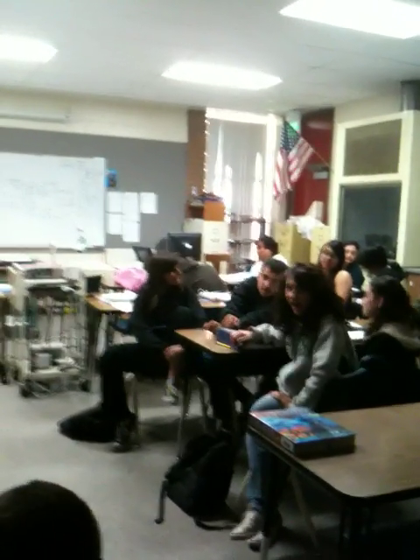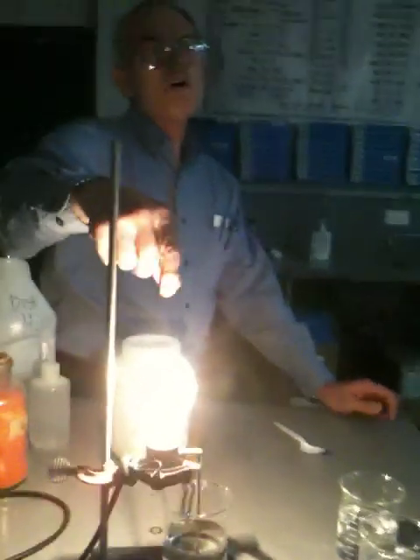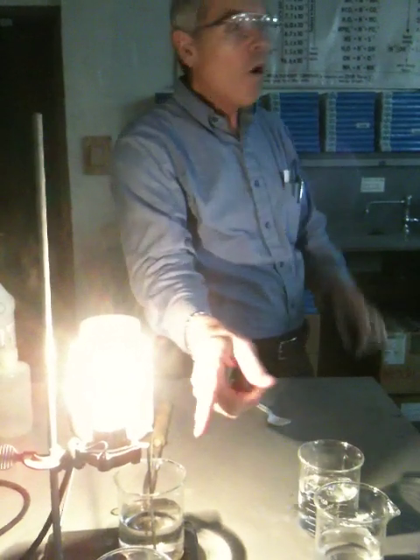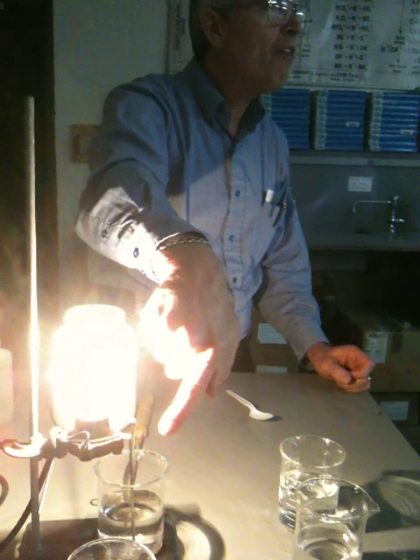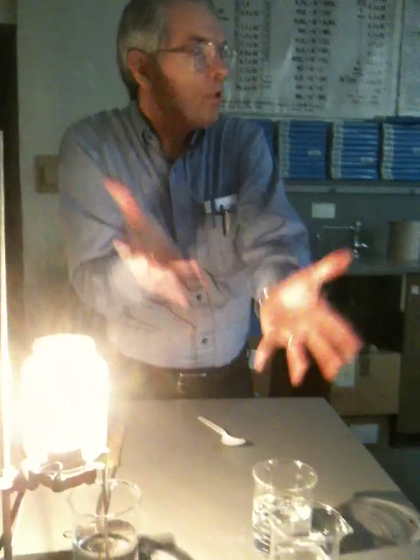Like, does the electricity run out of the ions? No — when you turn it off. The reason it won't run out is because this is alternating current, which means this is the cathode at one nanosecond, and the next nanosecond that's the cathode — it goes back and forth. That's called alternating current, AC. What would make it disappear is if I used DC — direct current. This would be the cathode all the time, and on the cathode I would get sodium metal, and on the anode I would get chlorine gas. Pretty soon all the salt would be gone — we'd have sodium metal and chlorine gas in the air.